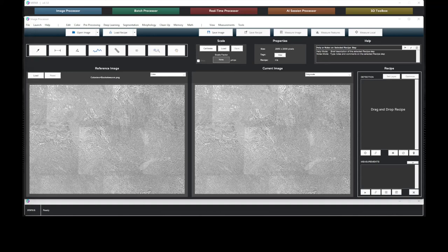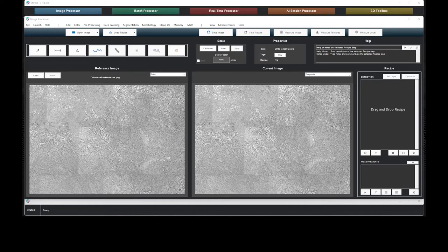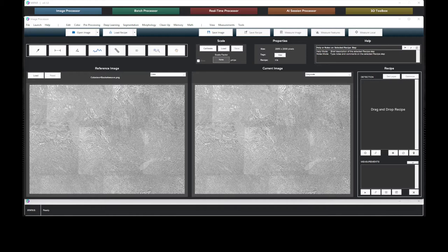When performing characterization of titanium microstructures, differentiating between basket weave and colony microstructures is notoriously challenging. The differentiating information lies within the orientation of grayscale information, and not in the contrast of the lamella.